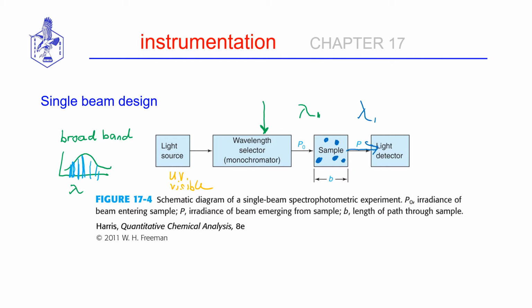These typically function in such a manner that however many photons hit the detector, that's going to create an electrical current that we can measure, and based upon the number of photons that hit, that's going to impact how large the current flow is.